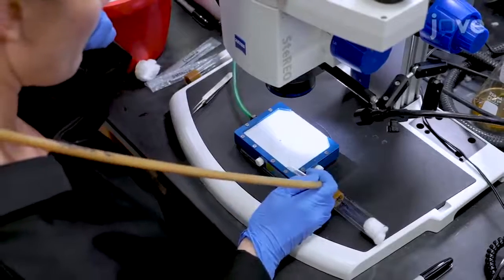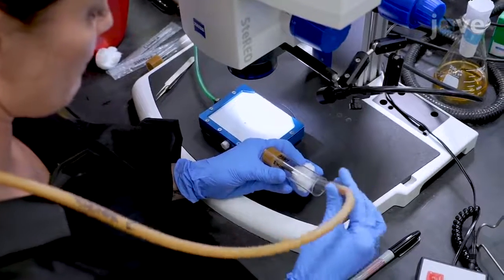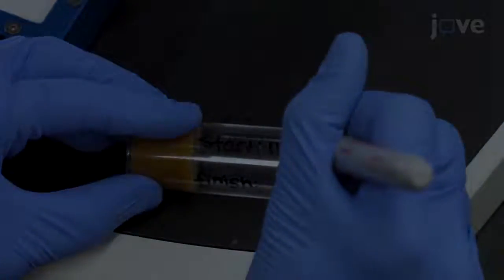Place the injected flies into a new food vial, noting the time that the first and last fly were injected. Lay the vial on its side until all flies have recovered to prevent them from getting stuck.